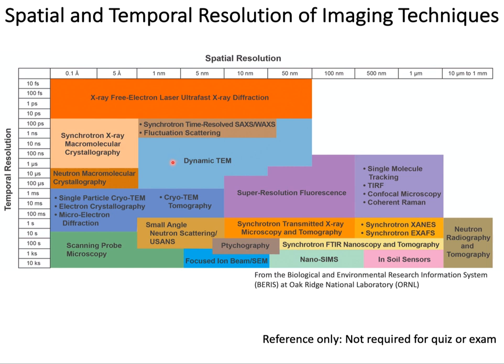But if you see the cryo-TEM in the dark blue with the mind-boggling computational power, you can even visualize a single atom at the resolution of 0.1 angstrom, or 0.01 nanometer. This is how we visualize the biological macromolecular detail of the proteins, carbohydrates, nucleic acid, atom by atom.